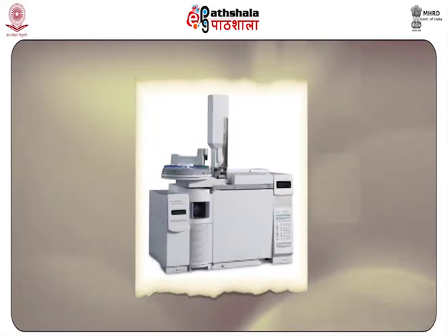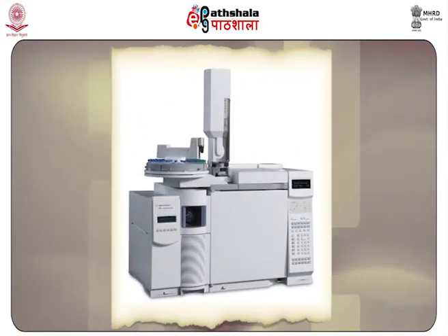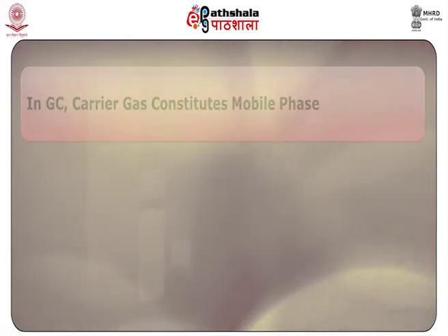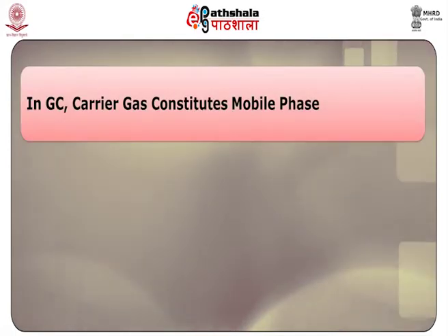Gas chromatography, or GC, is a popular analytical technique employed in separating and analyzing volatile compounds. Principle: in GC, a carrier gas constitutes the mobile phase, usually an unreactive gas like nitrogen or an inert gas like helium.